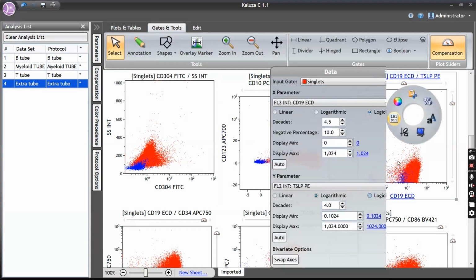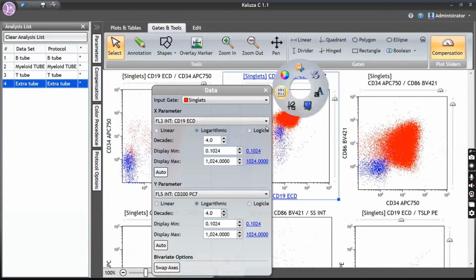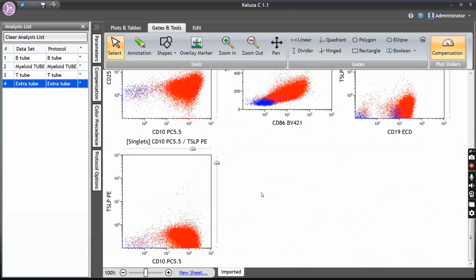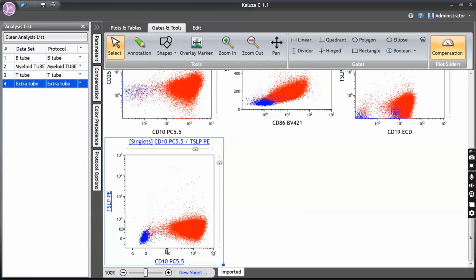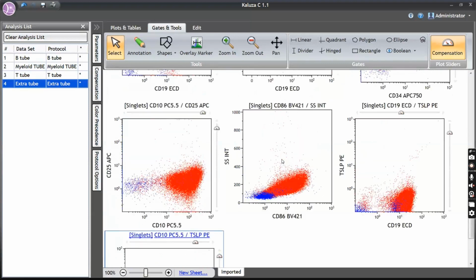TSLPR, these are all just extra markers, it's all negative. CD200 is positive in a bright fashion, because normal B cells are CD200 positive. Here the blast is beyond that, so it's bright positive. This is an extra tube which is completely luxury. If you want, you can add it, it is not mandatory. It will give you more information in predicting the cytogenetic abnormalities, and help you give a more leukemic signature of the blast with different new markers.